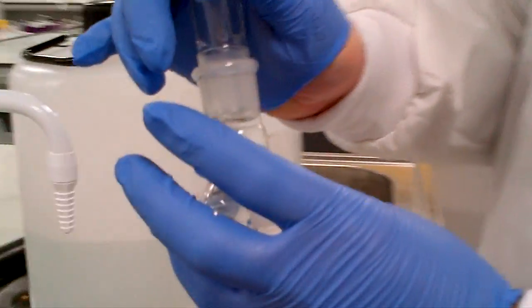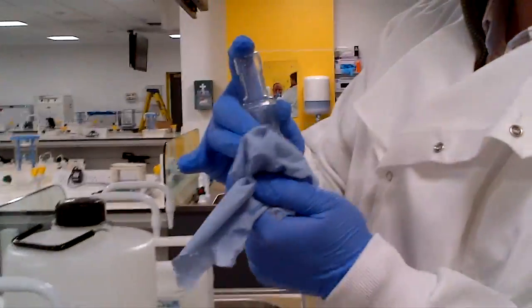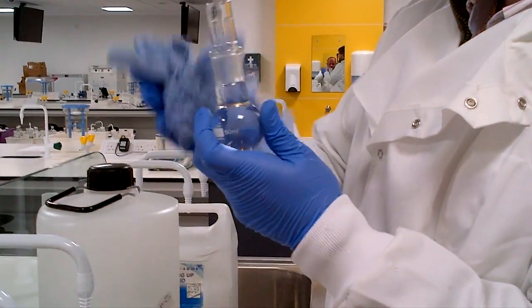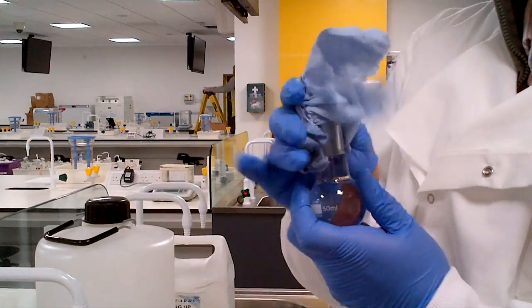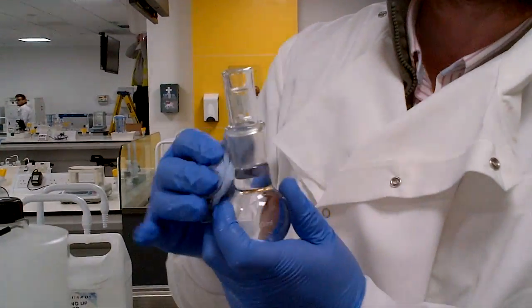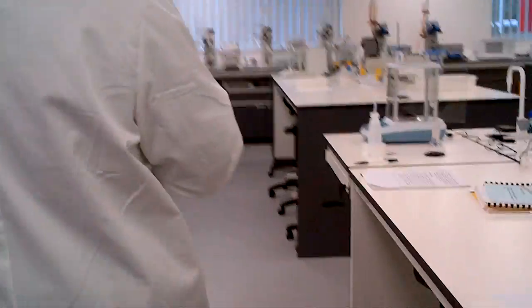Stopper in place, overfill, and again clean excess or remove excess water at the base of the flask. Clean the neck, dry. You might need 2 or 3 bits of tissue paper to do this. Make sure as well that your gloves are dry so you're not transferring water droplets back onto the flask. We come back towards the balance area.